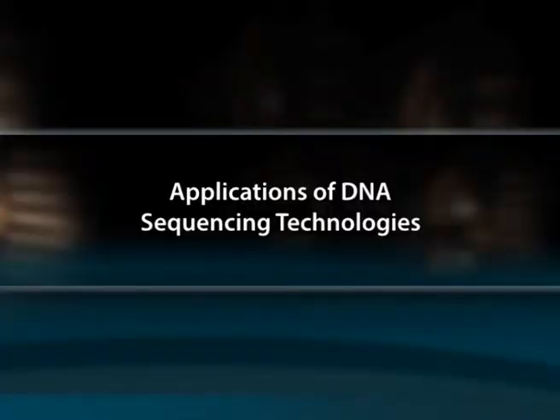Noise in these data comes from possible sequencing or base calling errors and the need to map the sequence segments back to the genome. Several methods have been developed to analyze these data using ad hoc approaches or some probabilistic modeling. Applications of DNA sequencing technologies. Knowledge of the sequence of a DNA segment has many uses.